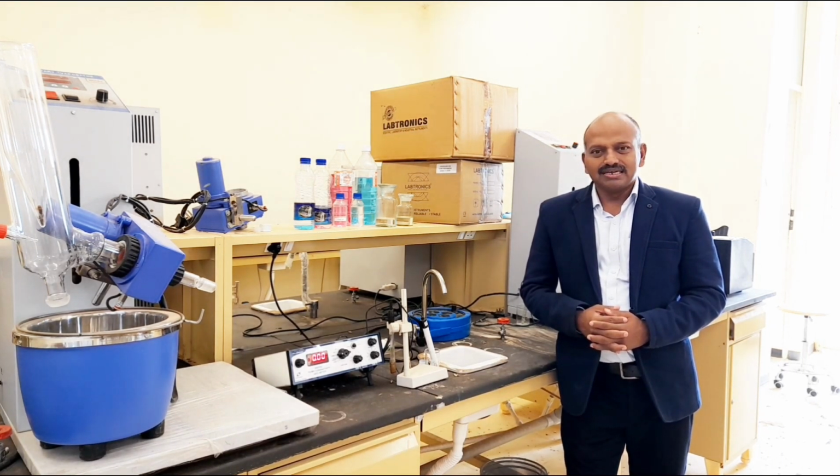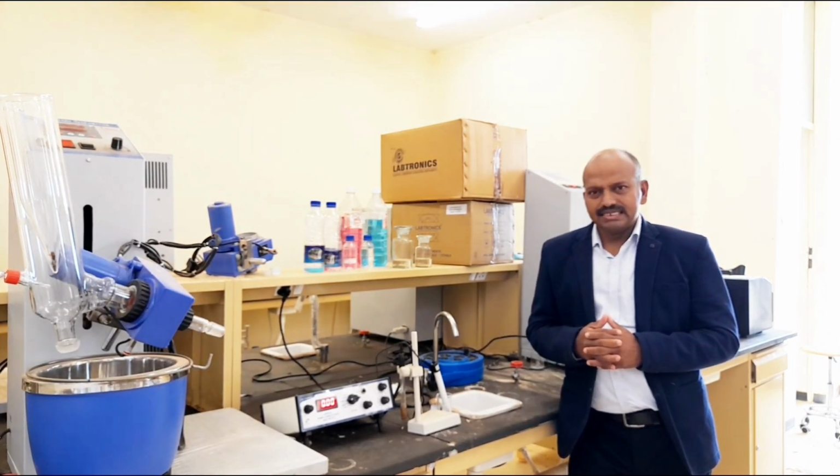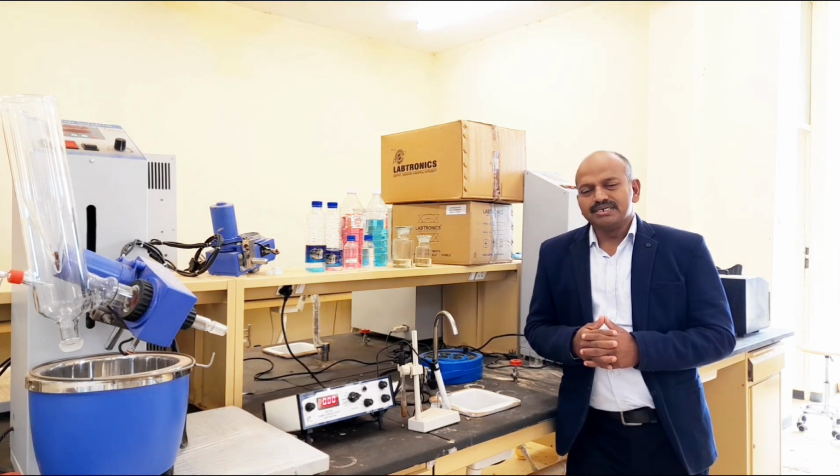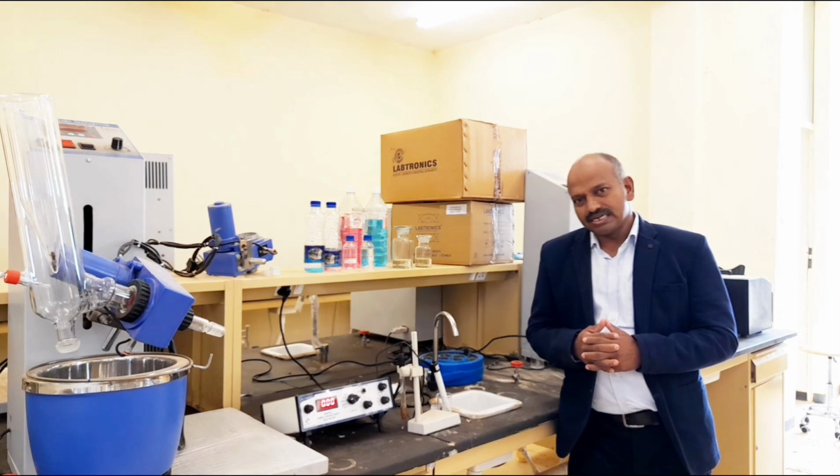Today we'll discuss a very important experiment, that is mixture analysis. If we see the systematic procedure of this experiment, we can see the aim, that is to determine the percentage composition of the mixture sodium chloride and sodium hydroxide in a given sample.